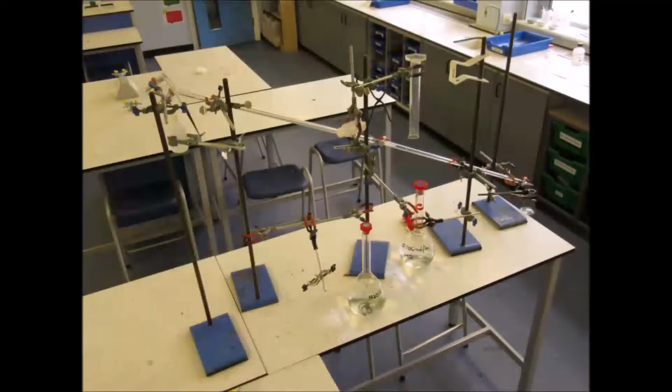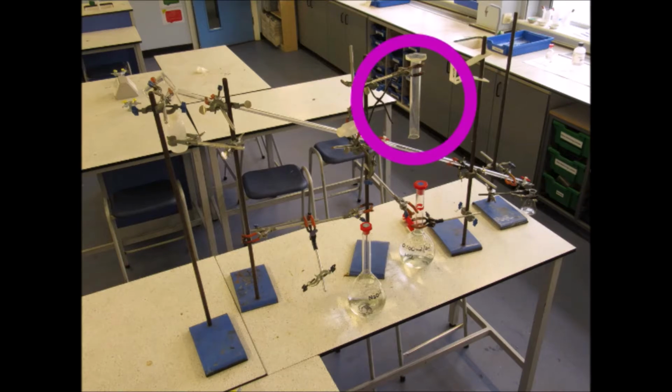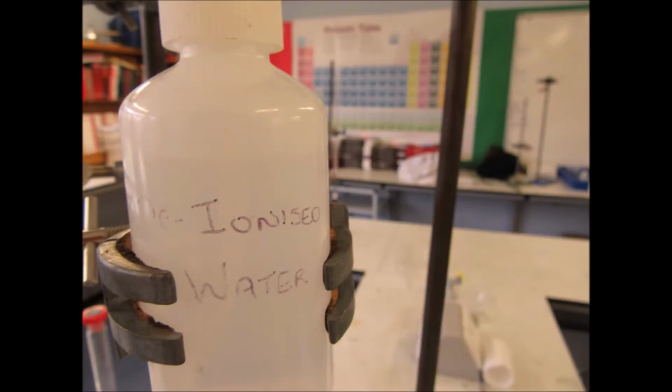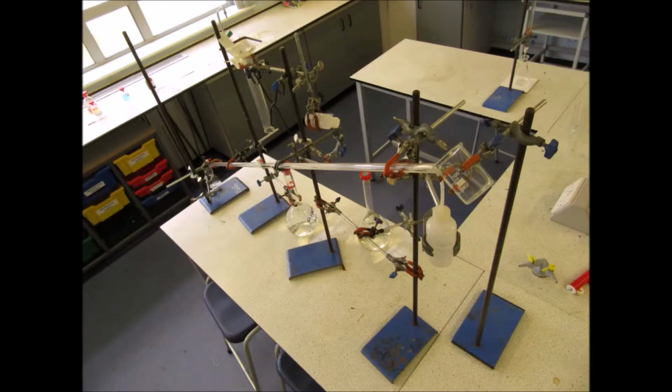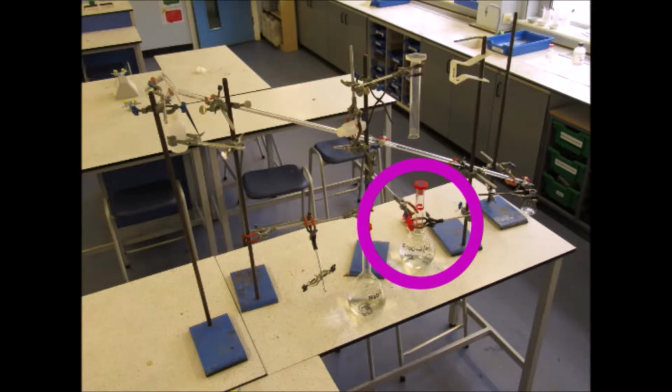Unlike this, notice how superfluous equipment has been used. The measuring cylinder has been positioned upside down and is not necessary for this experiment. Both the deionized or pure water and the conical flask have been badly placed. The super burette is not suitable for this experiment, and although the acid solution has been clamped securely, which is good safety practice, it is not practical in this situation.